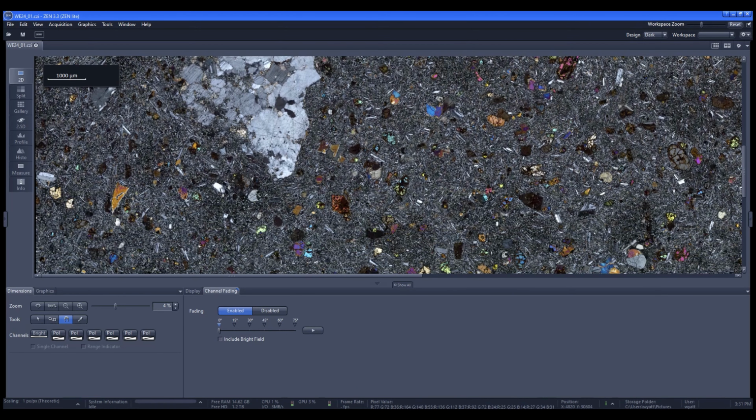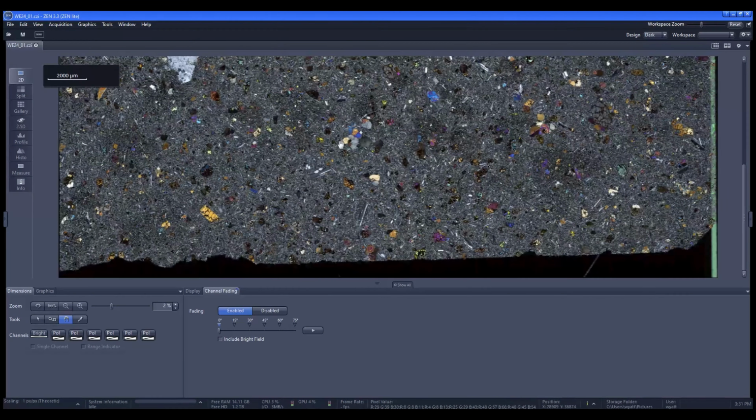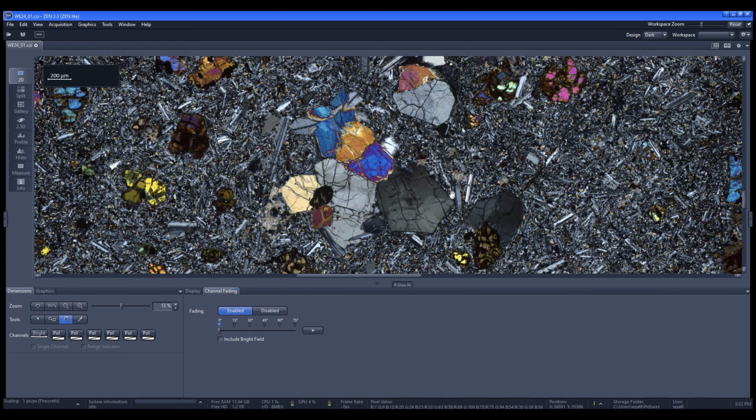There's actually another example somewhere in here, and it's not just one mineral. Here we go. So we have some olivines fused with some pyroxenes and a plagioclase. So this is a glomerocryst, another chunk of the magma, and obviously a larger chunk of it. This could have been the magma mush that got pulled into either the existing magma when it erupted, or maybe some new magma came ripping on through, and this got incorporated into the conduit and erupted at the surface at the volcano.